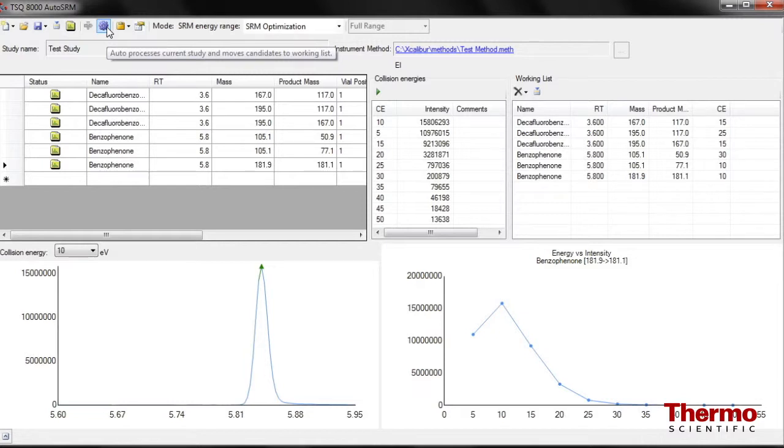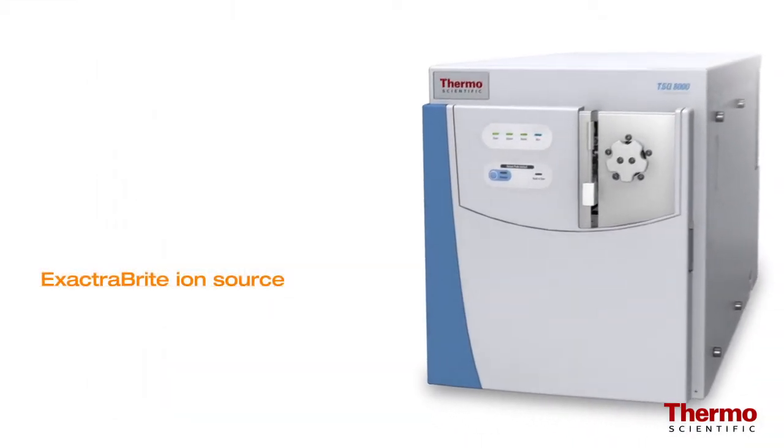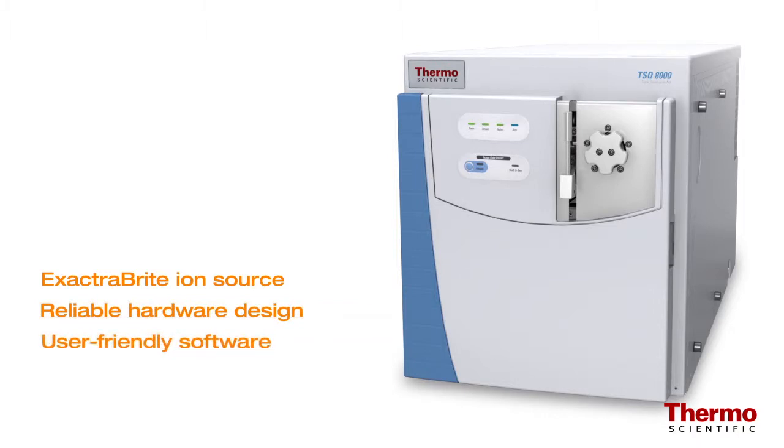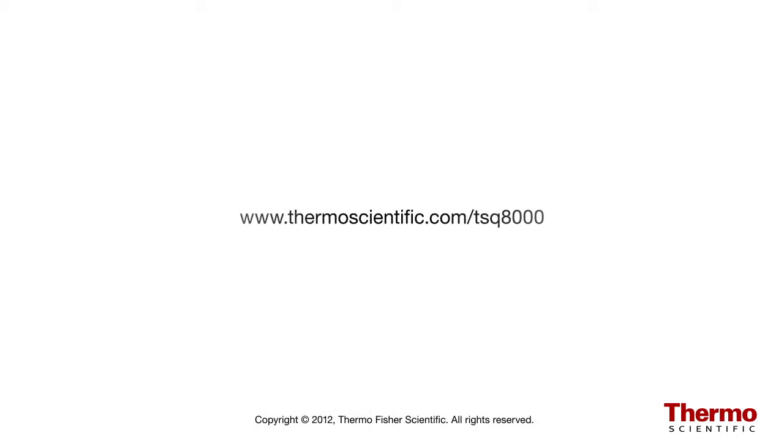Uncompromised SRM simplicity — another main advantage of the TSQ8000 system. With the system's innovative Extract-A-Brite ion source, proven reliable hardware design, and user-friendly software design, the TSQ8000 offers uncompromised MS-MS simplicity to maximize the analytical advantages of high-performance GC triple quadrupole technology. To learn more, contact your local sales representative today or visit www.thermoscientific.com/TSQ8000.